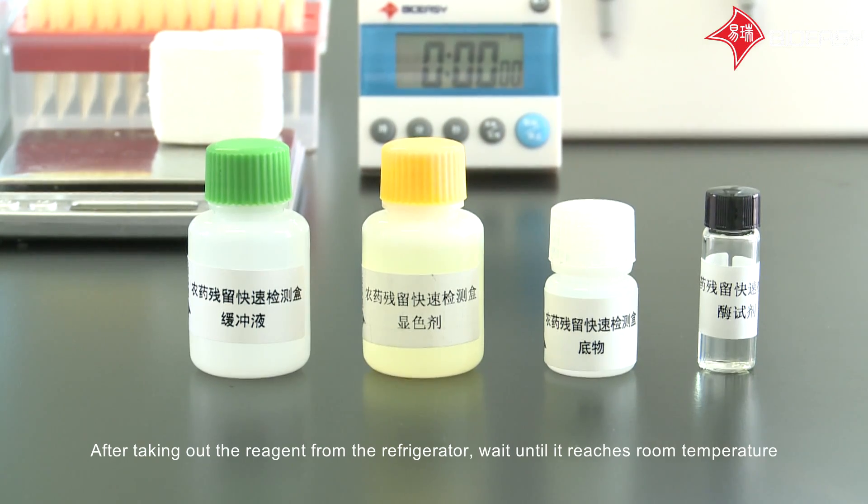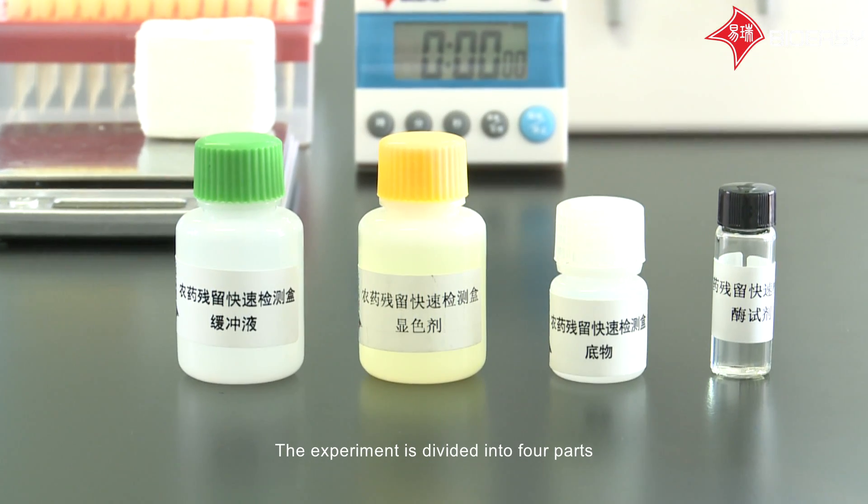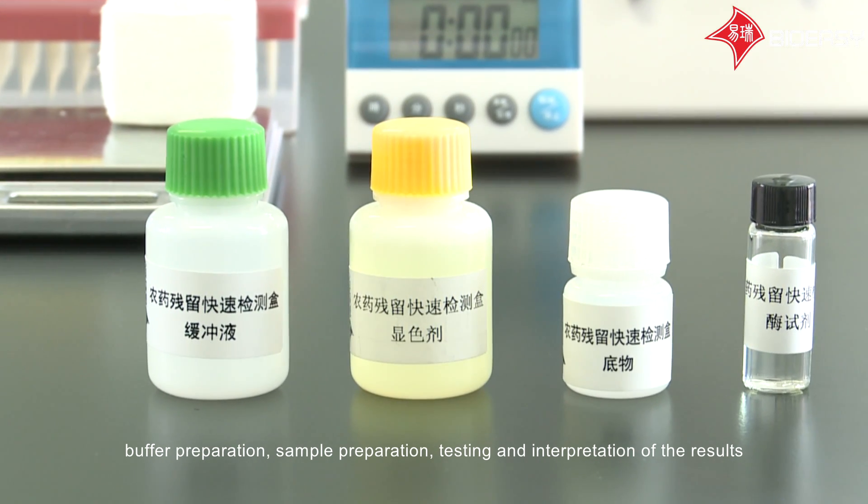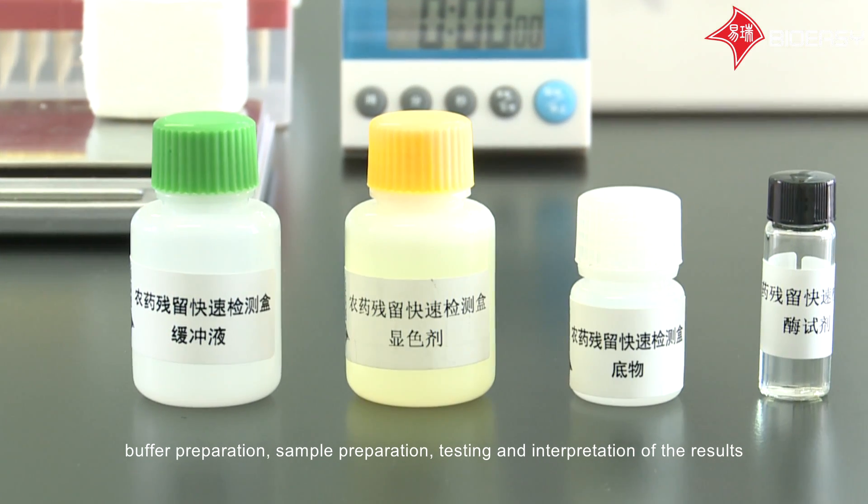After taking out the reagent from the refrigerator, wait until it reaches room temperature. The experiment is divided into four parts: buffer preparation, sample preparation, testing, and interpretation of the results.